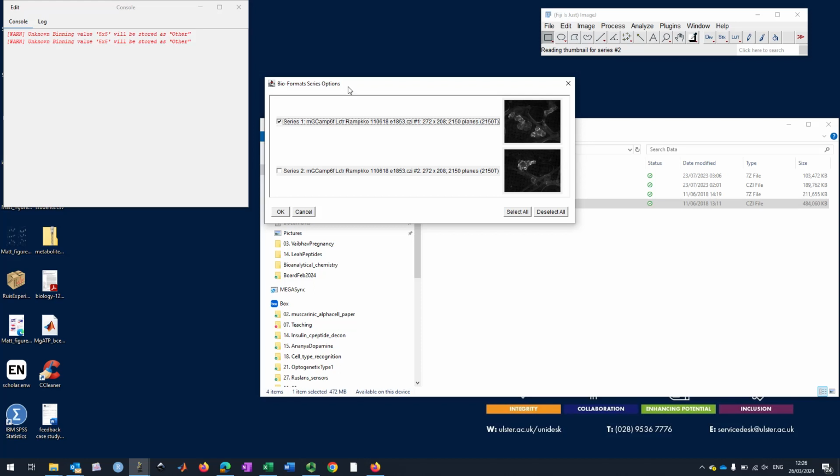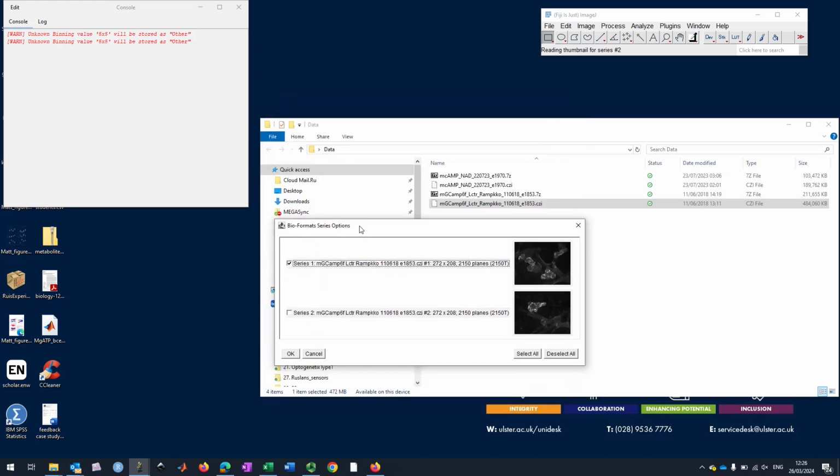The file contains more than one series. That is, the data was acquired in two different populations that were imaged in a pseudo-simultaneous manner. We have an automatic table that moves from one spot to another. In two spots on this table within a special perfusion chamber, there are two different types of objects, two different types of cells, and they were imaged continuously throughout a certain time.